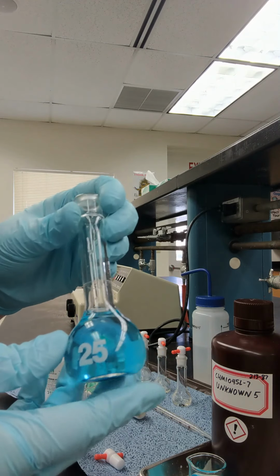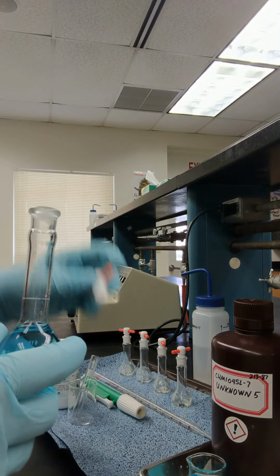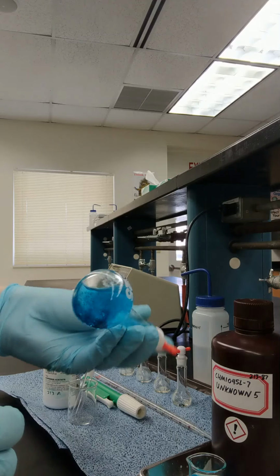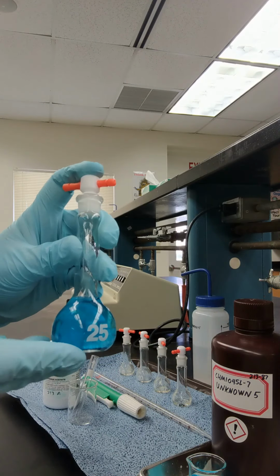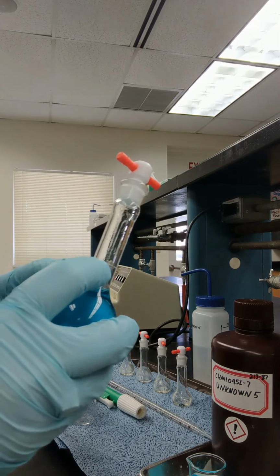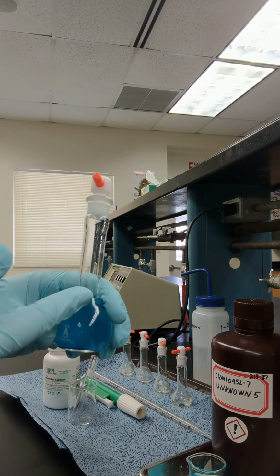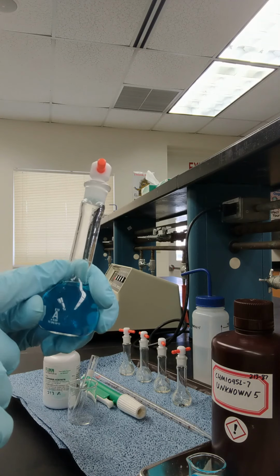So I'm going to settle my volumetric flask to one side, and you can cap the volumetric flask and start mixing it until everything dissolves. If you complete the volume all the way to the 25 line mark here, and not all of the solid dissolves, when the solid dissolves, that volume is going to increase and it's going to pass that mark.